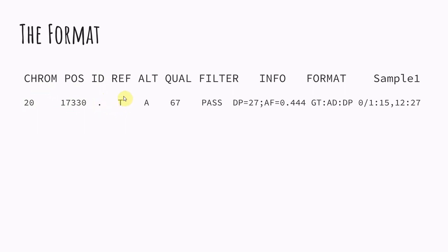So this is what the reference said. So it says it was a T at this position. Our data is saying that it's an A. So we had a quality score of 67. The filter was passed.